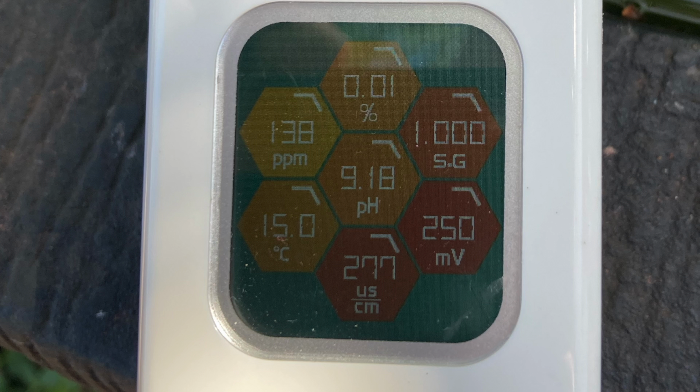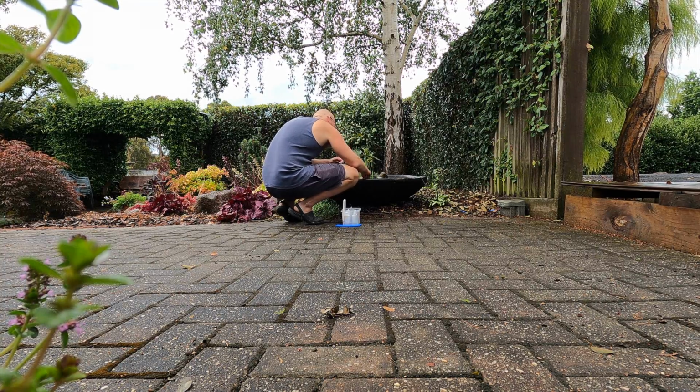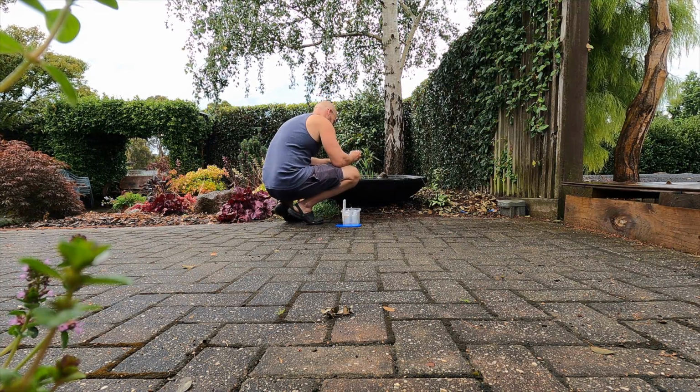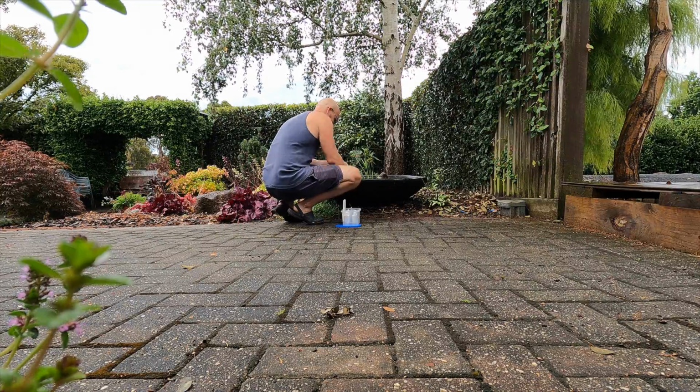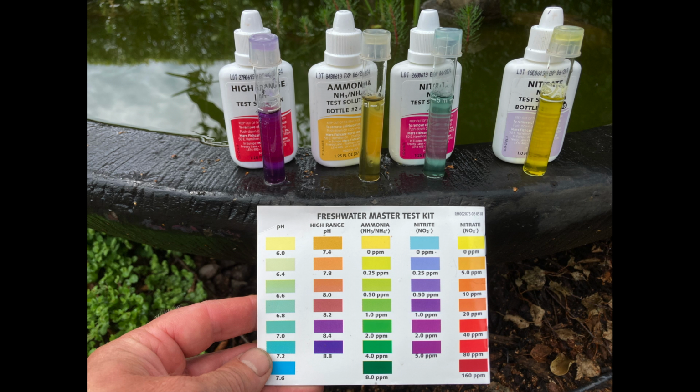Anyway, the thing that immediately jumped out when I tested was the pH, 9.18. I've never seen my pH that high on any aquarium or pond. So I figured all this testing on the different ponds has already buggered up the unit, but I was interested, so I got out the old API water test kit and tested all the parameters. Sure enough, the pH reading was as high as the test goes.